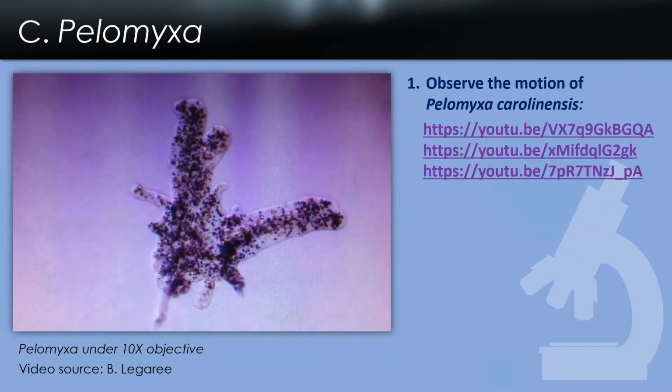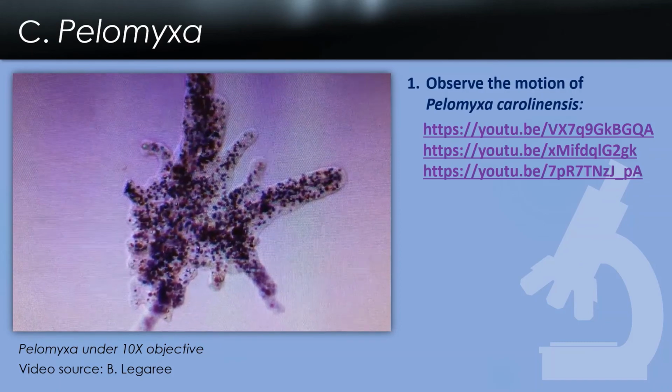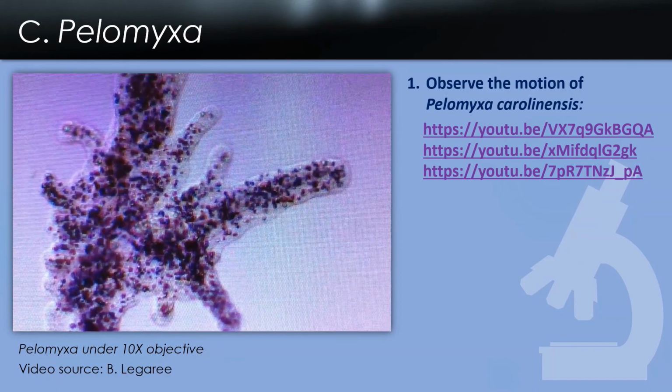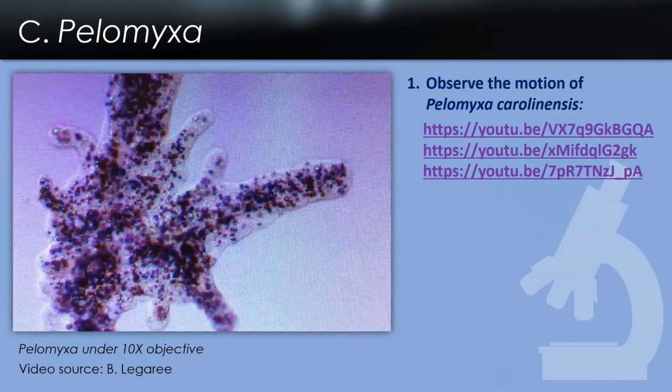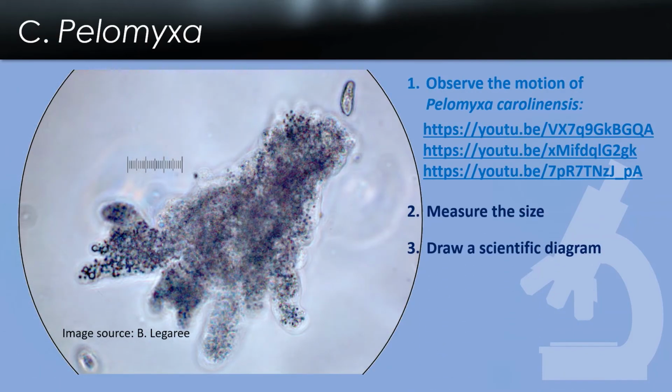The third video is something that was done a little bit more professionally with really expensive looking photography equipment, and is a very, very beautiful video. And you can see the amoeba moving and maybe make out a few more details. So for the amoeba, I want you to measure the size, and I want you to draw a scientific diagram.